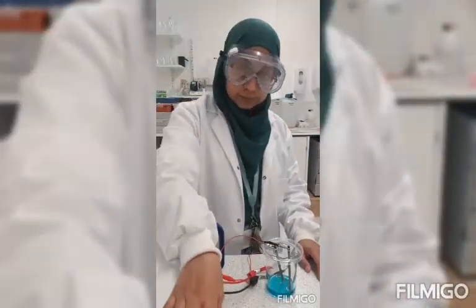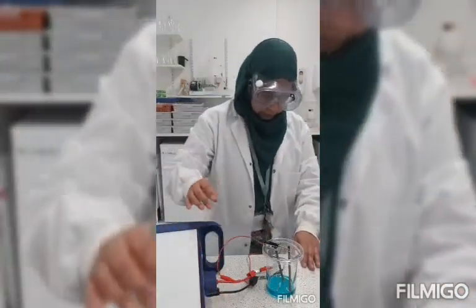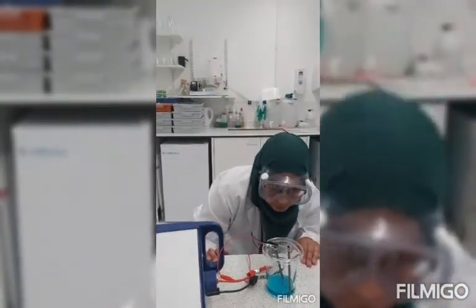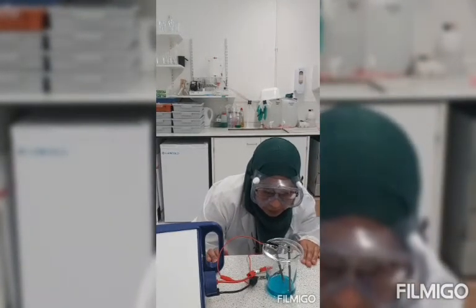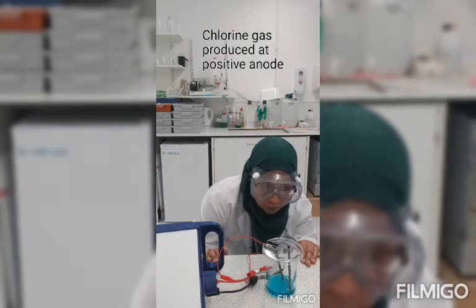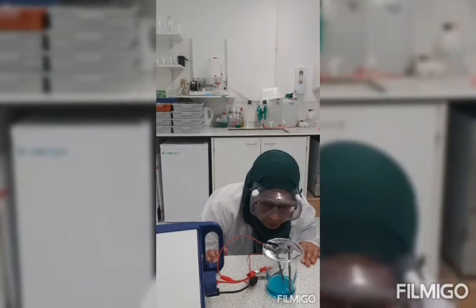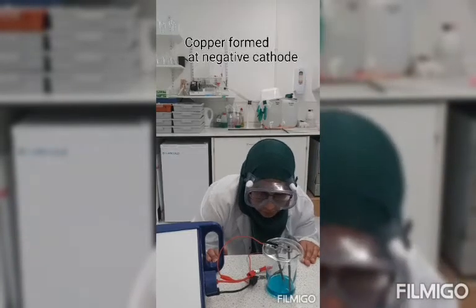When I put it on, you can already see one of them is bubbling, so therefore we have some gas being produced, and that is chlorine. And the other one is changing colour. There's a layer of copper forming.